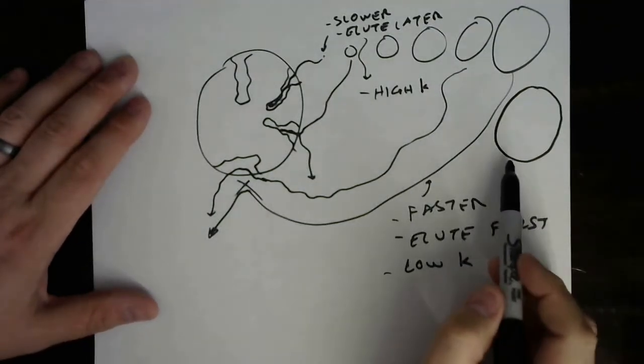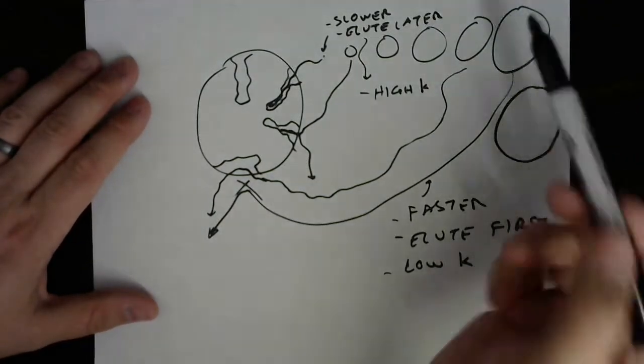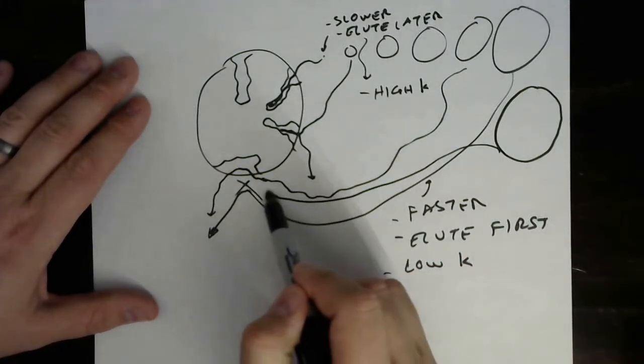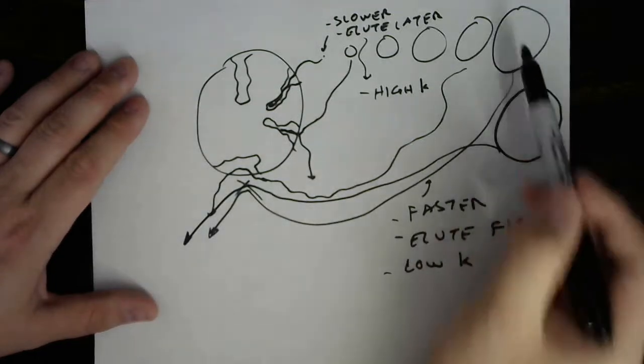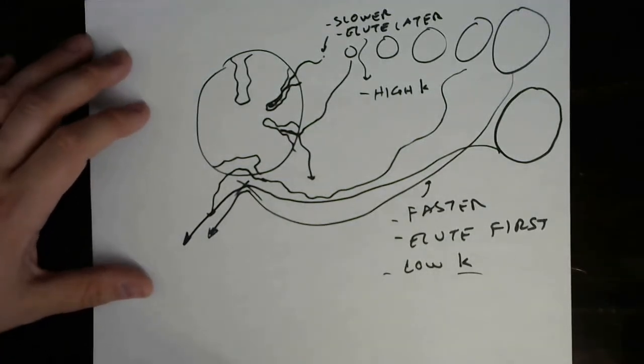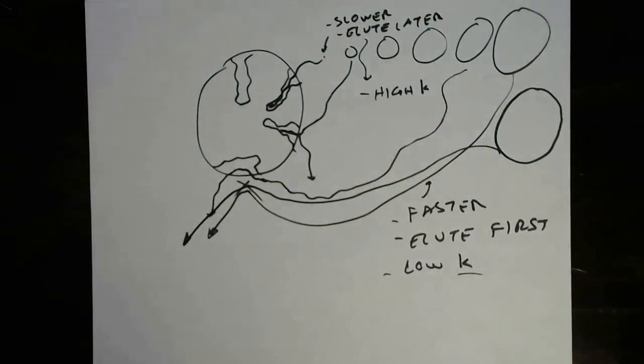We're going to say that's a little bit bigger than that. I don't know if it really is. But it basically has the same access to inside this particle that that one did. And that gives it the same value of retention. They will both end up, despite being different sizes, in the total exclusion peak.